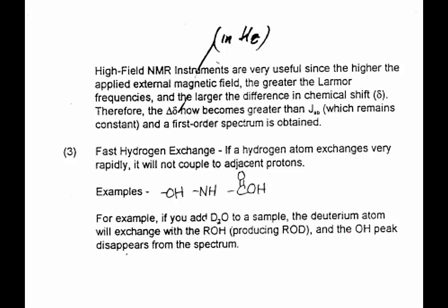So instead what we do is we take a solvent and we replace all the hydrogens with deuterium. Deuterium from lecture. The first time you see a D in your organic book, you go, wait, there's no D on the periodic table. What element is that? And it's not. It's the isotope of hydrogen with a mass of 2. And so you can basically enrich your molecule in deuterium.